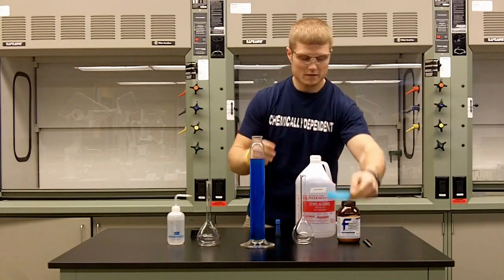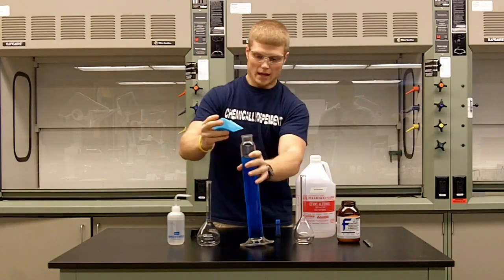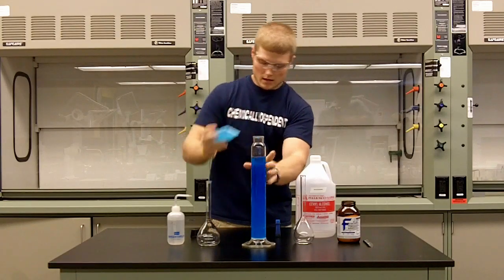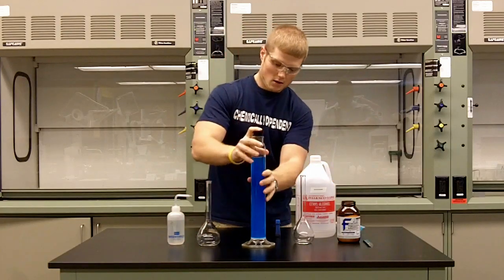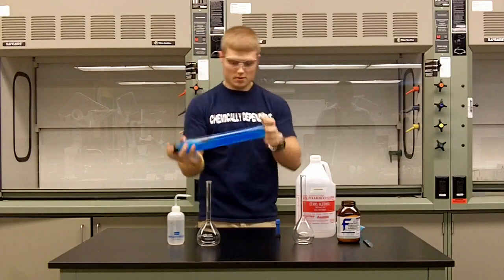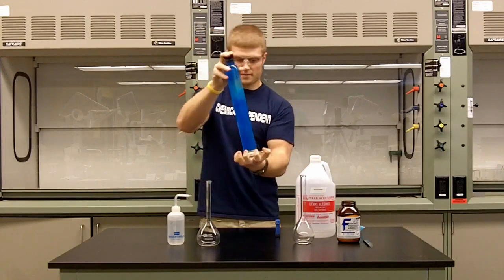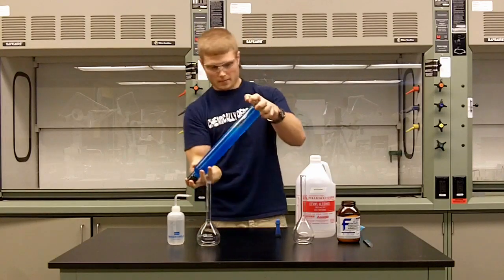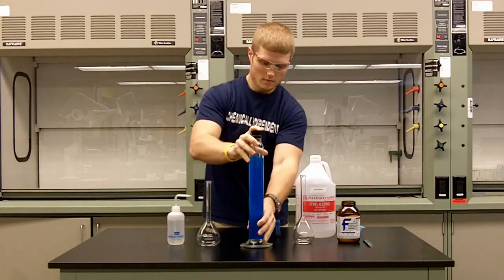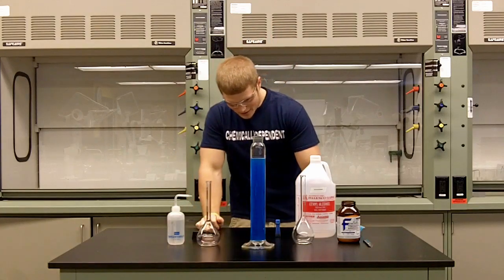We'll add 15 grams of potassium carbonate, which is just a simple salt, and what this will do is separate the ethanol and water. First we have to shake it up to get the potassium carbonate to mix in with the liquids. And wait and see what happens.